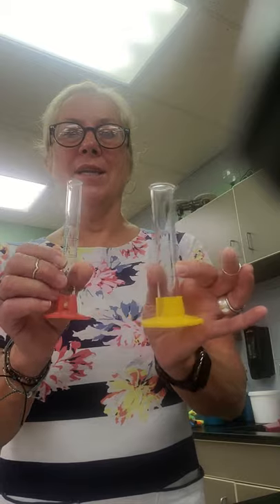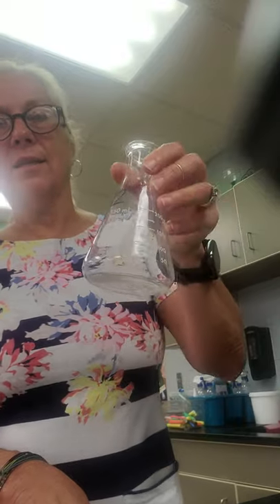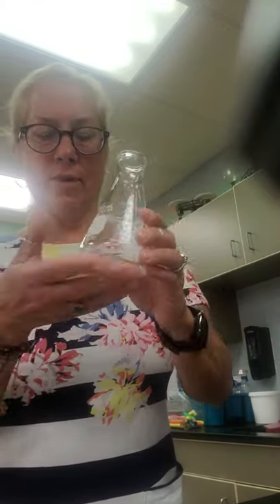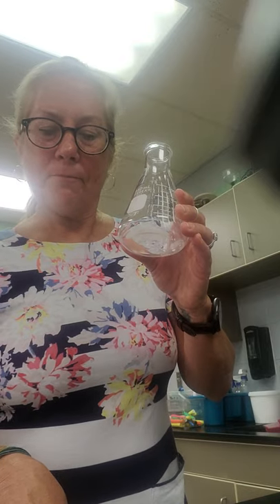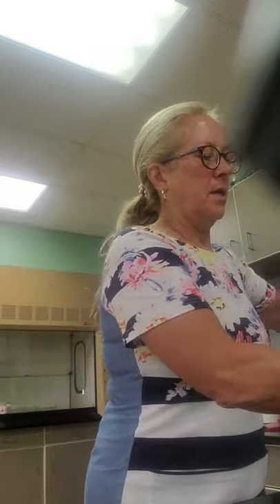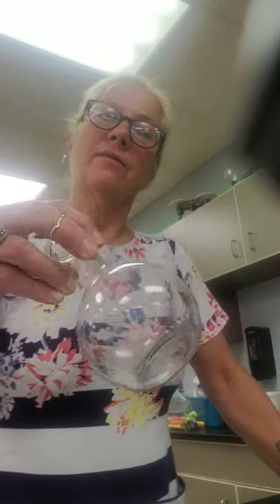So that's funnel and funnel support for three and four. Number five: for measuring volumes of liquids, you would use graduated cylinders — you have a 25 mL and a 10 mL. Number six: these are the flasks. Six is the Erlenmeyer flask — it's the straight one, used for mixing and heating.